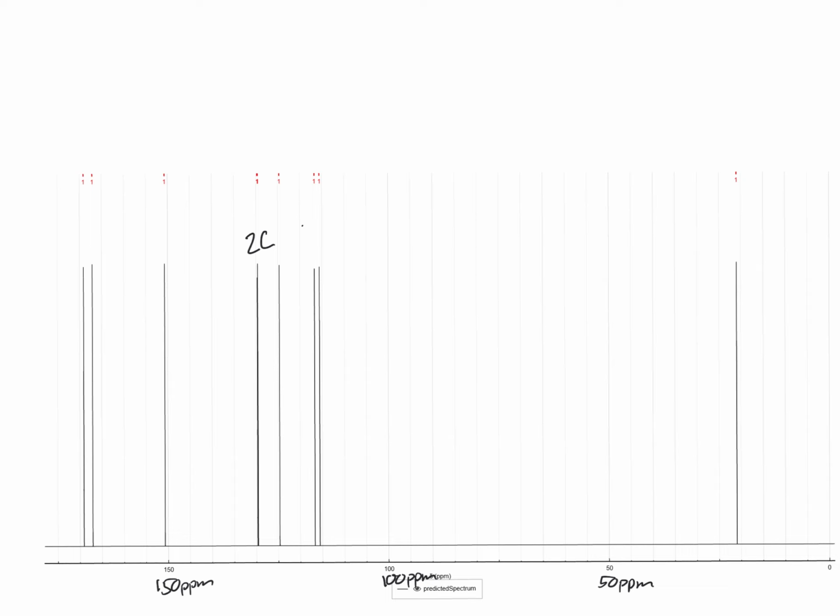So go ahead and pause this, rewind, and look at the different pieces of data, come up with your own solution, and then press play again, and we'll work forward with my proposed solution.